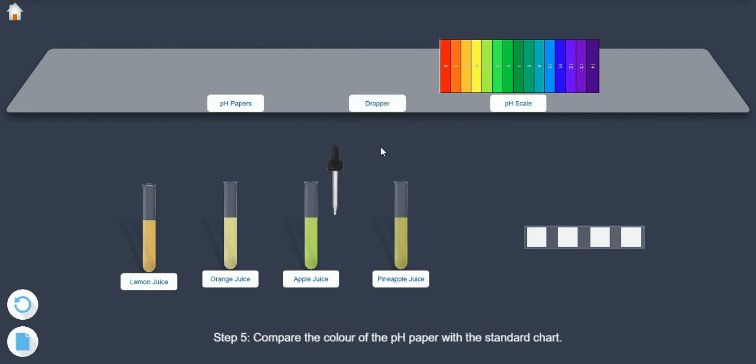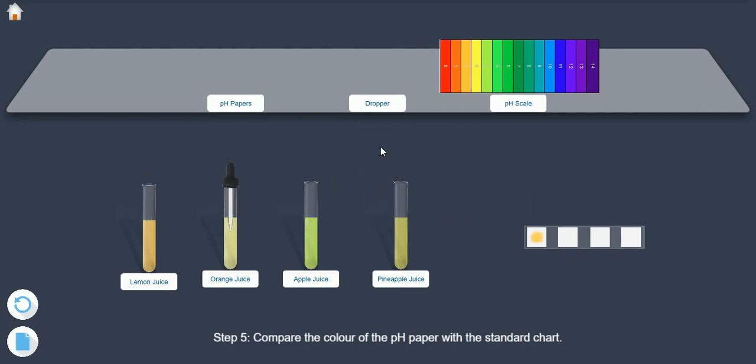Step 5: Compare the color of the pH paper with the standard chart.